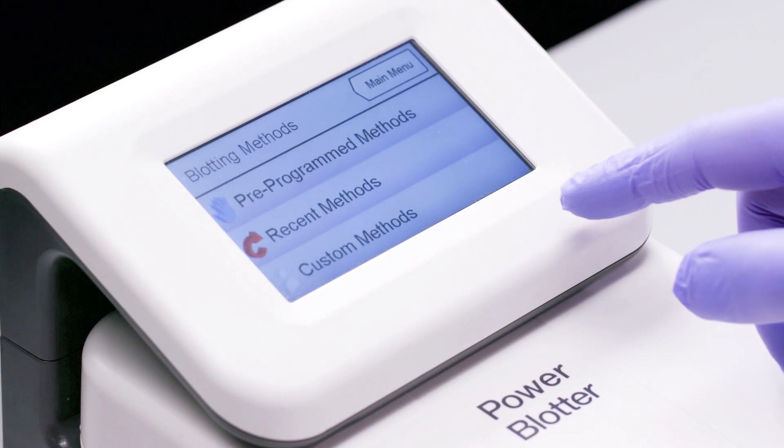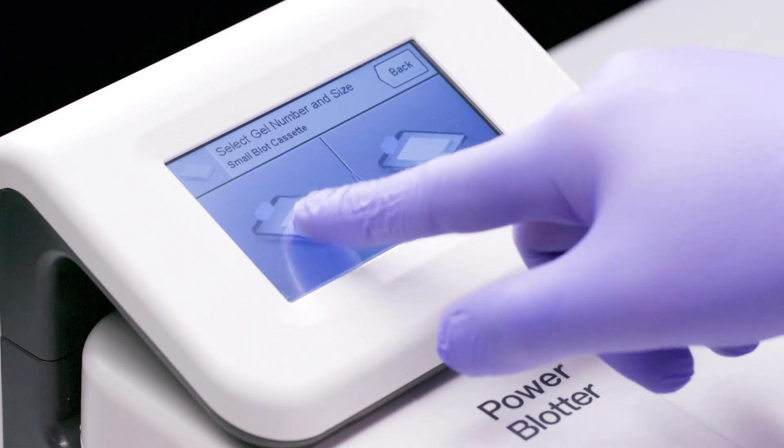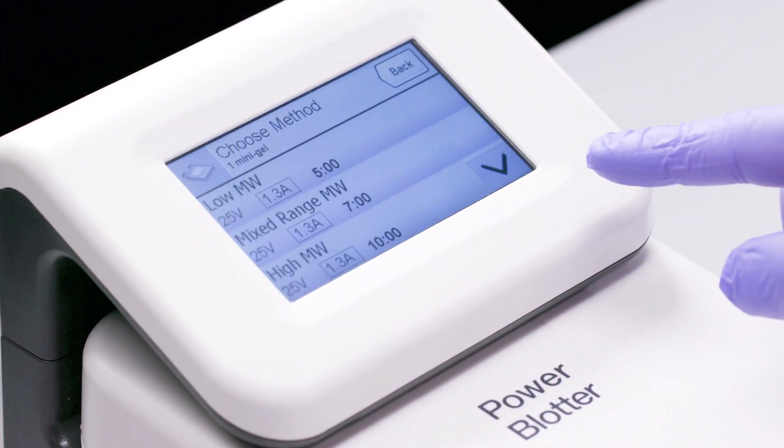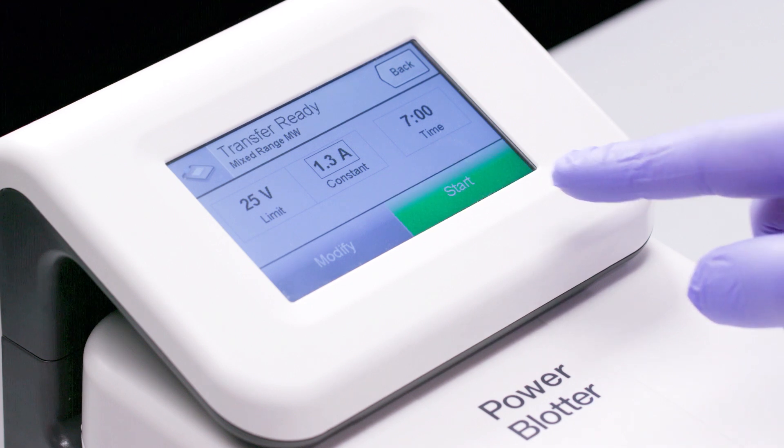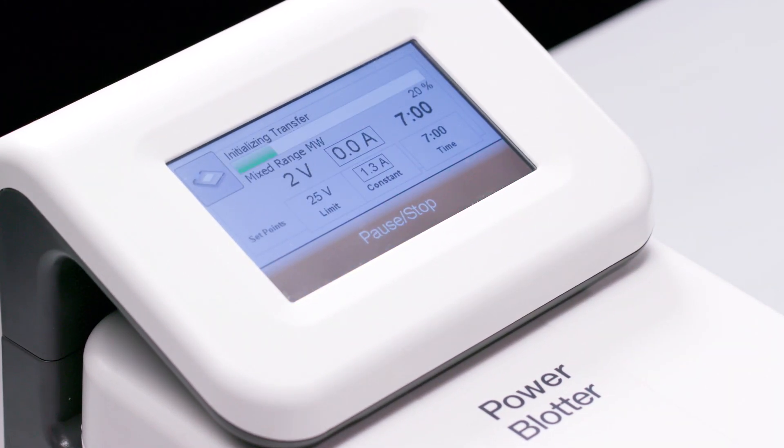The power blotter system has pre-programmed transfer methods that are based on the number of gels being transferred and the molecular weight range of your proteins of interest. Custom methods can also be created. After selecting or creating a method, simply press start to begin the transfer.